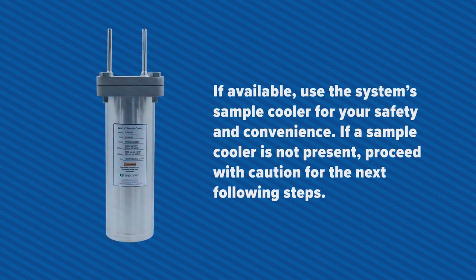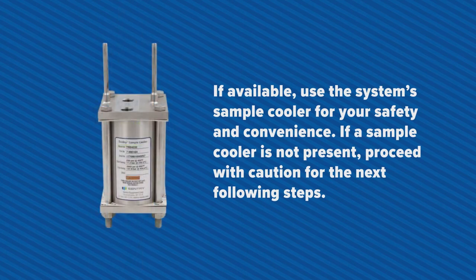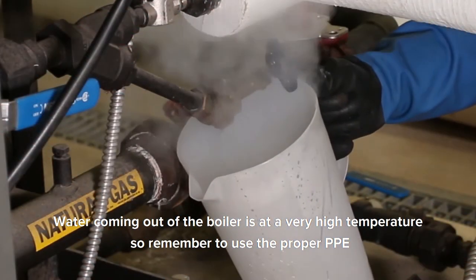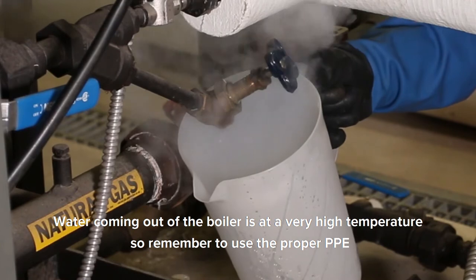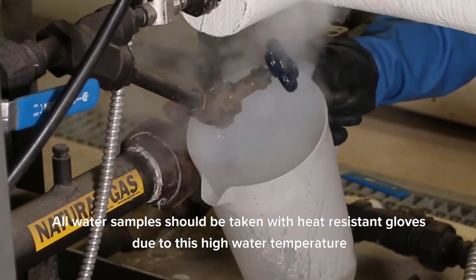If available, use the system's sample cooler for your safety and convenience. If a sample cooler is not present, proceed with caution for the following steps. Remember, water coming out of the boiler is at a very high temperature, so remember to use the proper PPE. All water samples should be taken with heat-resistant gloves due to this high water temperature.